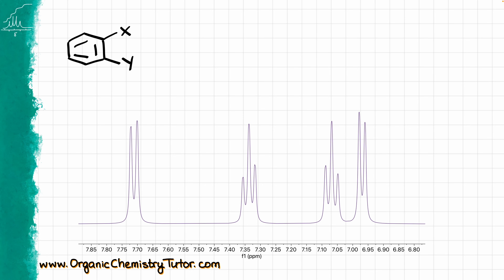Things get more interesting when we go to disubstituted aromatic compounds — very common on exams. Starting with the ortho-substituted aromatic compound where groups X and Y are different: all four protons on the aromatic ring should give separate signals. We expect a doublet, triplet, triplet, and another doublet. Looking at the spectrum, I have doublet, triplet, triplet, and another doublet — everything fits. Whenever you see two doublets and two triplets, that is the ortho-substituted aromatic ring.